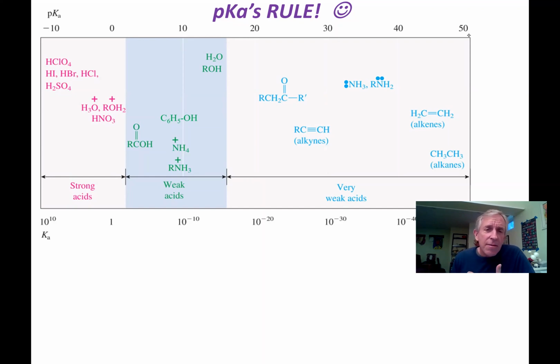So here I'm hoping that maybe we can rely on some of your previous knowledge. For example, if I asked you if you wanted to stick your hand in a beaker of very concentrated sulfuric acid or hydrochloric acid, you would hopefully pause on that one and not do that, because you know those sound like very scary strong acids, and that's exactly what they are.